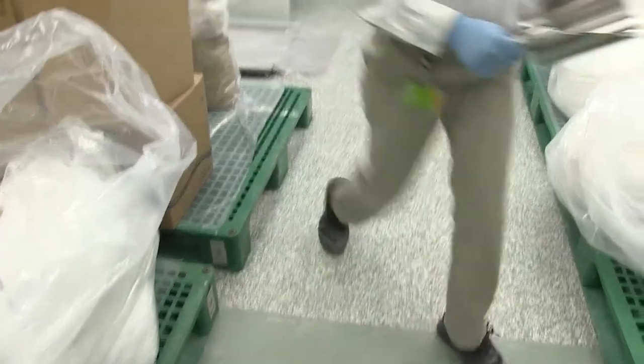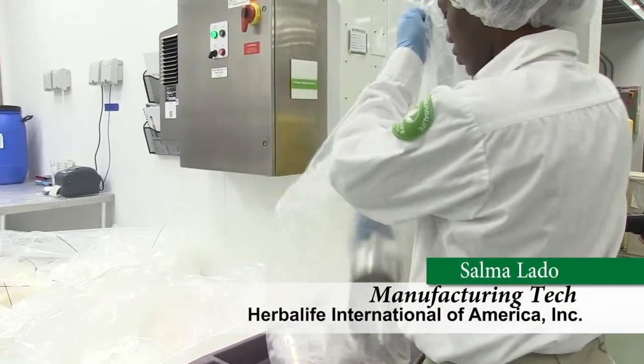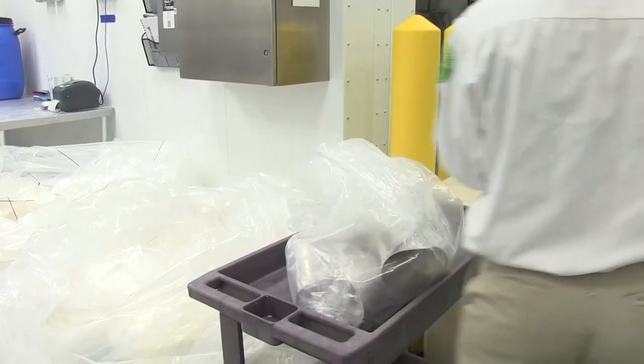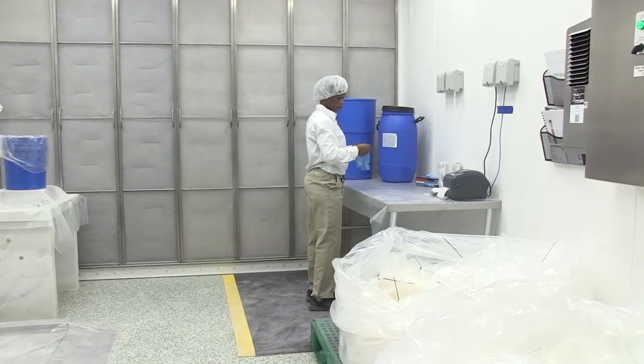Gloves are required when handling product or when working on surfaces that may come into contact with product. Always sanitize gloves or get new gloves before starting work or contacting product.